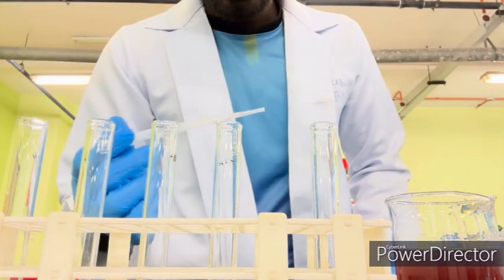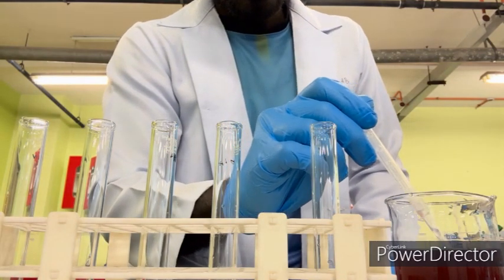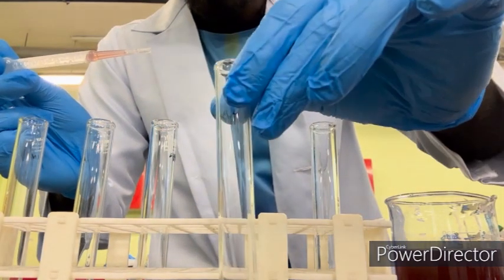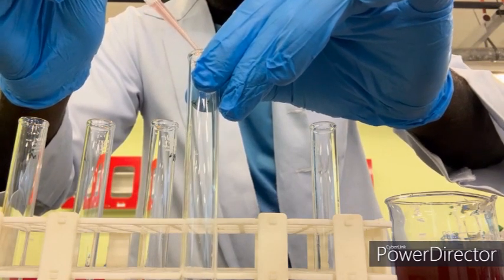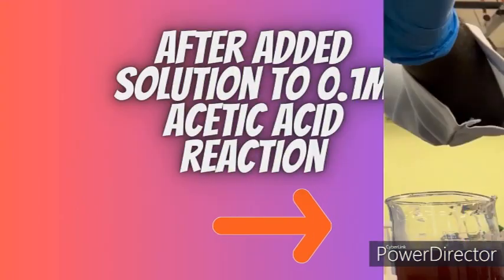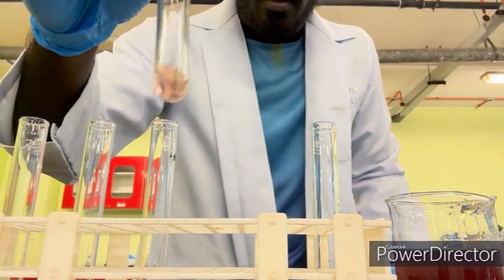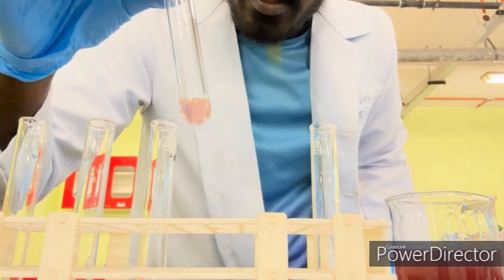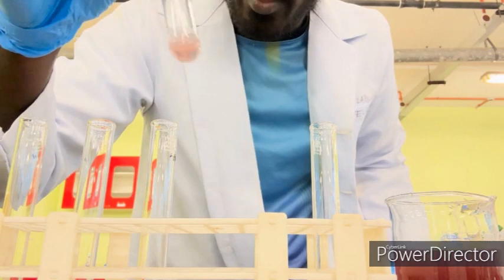Okay, now for the second, I'm going to add it into 0.1 M acetic acid. So this is 0.1 M acetic acid. Okay, going to add a few drops here. Okay, so here we can see there's a bit of color change in 0.1 M acetic acid.